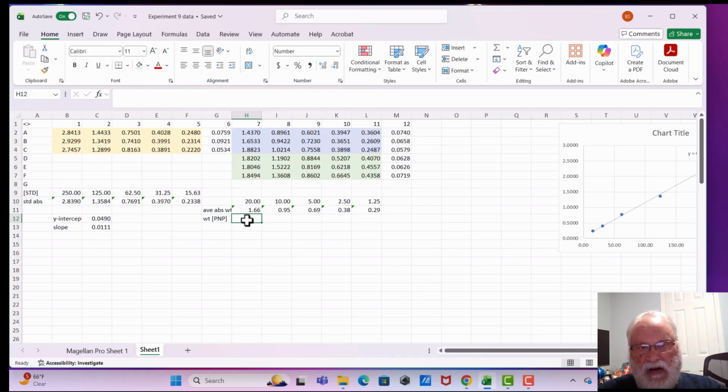So it'll do all the operations in that order, and they'll always go from left to right. So we'll go ahead and put in equals, and I want the subtractions to be done first. So it's the y value minus the intercept.